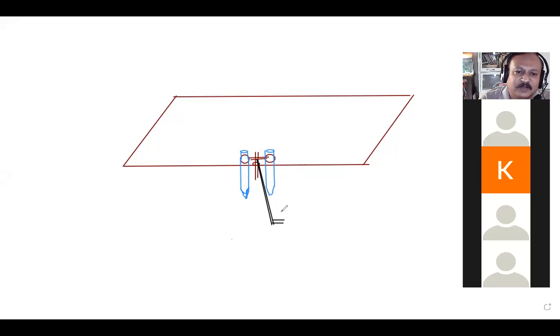Maybe I'll just show you the movement of this. Suppose you move this handle like this, either in the clockwise or anti-clockwise direction, then these tubes would start revolving like this. Do you remember it or no?